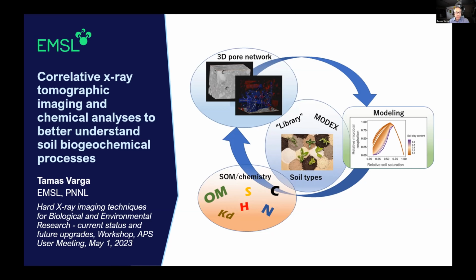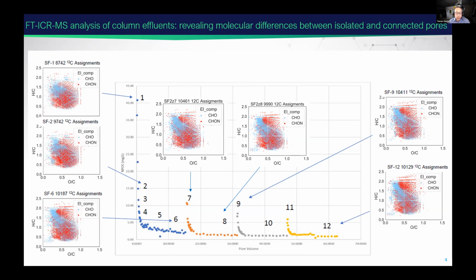We expect that we get organics that are less tightly bound coming off from the larger pores, and they are expected to be different from those coming off at, for example, point 6 at the end of this stop flow run, where the organics from the smaller pores, the more stabilized organics, come out. So these are the types of differences that we can reveal.